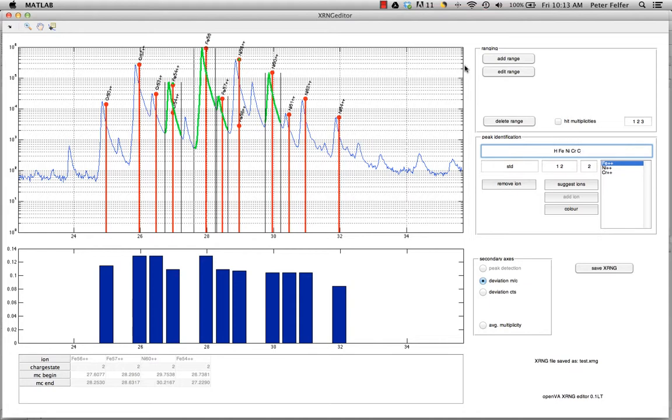And that's then, I think, for Light Editor, pretty much everything there is to explain, because I think add range, edit range, and delete range are pretty straightforward. If you have .epos files, you can actually define on what it's working on, so you can define the hit multiplicities you want to be working on. Especially, there's a paper by Lanciao where it's shown, for example, that in steels, carbon mainly comes off as multiple hits, as double hits. Then you can restrict your ranging to double hits, which can be very handy sometimes.